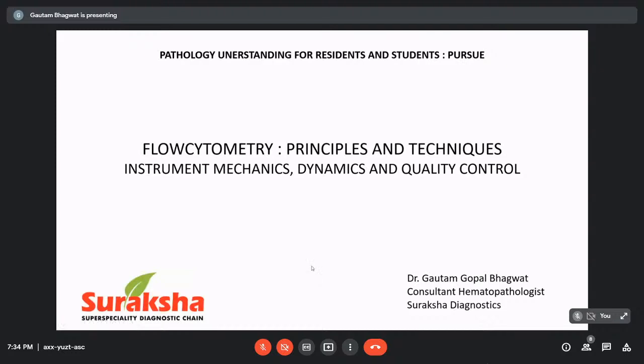Good evening, everyone. I hope everybody is safe. And I would like to thank Dr. Nadeem for giving me this opportunity to talk on flow cytometry principles and techniques. Over the next 60 to 70 minutes, I would go through basically what the flow cytometry machine is, what we as doctors and technicians do with it, and what is the importance of quality control. I have kept this talk very basic as it is for the residents and the students per se. So I would not go much into the complicated things of it, and I'll just keep it to a basic.